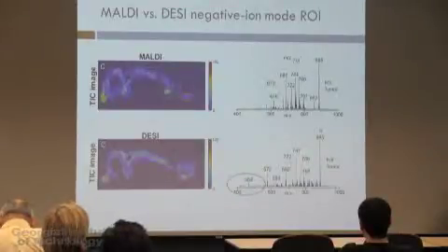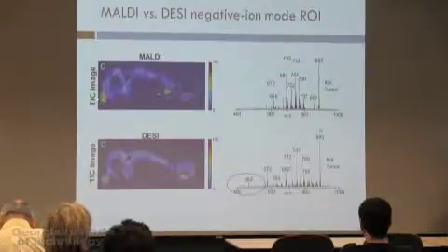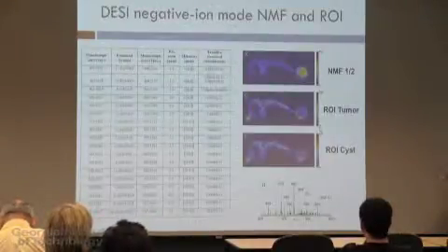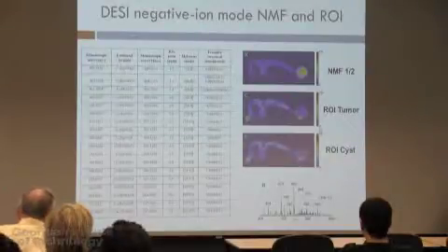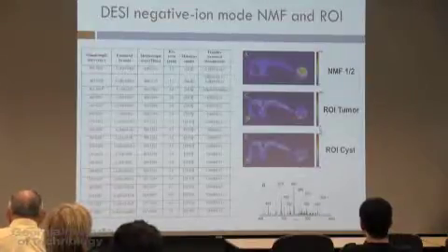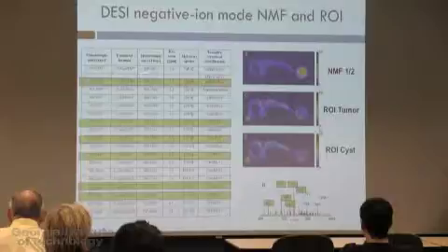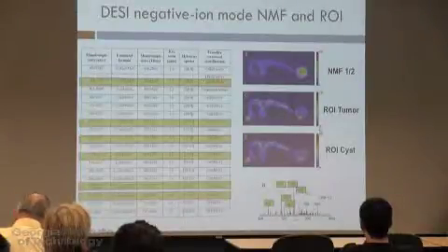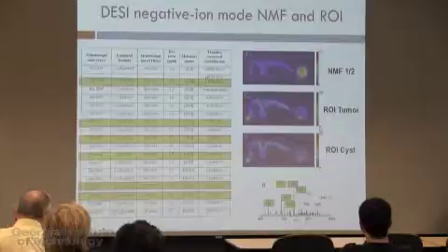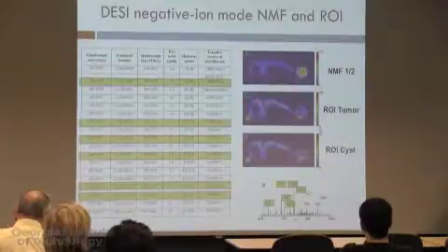On the other hand, look at the MALDI data for the ovary. The ovary and the early stage tumor are lighting up like crazy in MALDI. So there are things that we see in MALDI that we don't see in DESI and vice versa. All right, it's a long list, but what's important here is that these are the main species that we see changing in early stage tissue. They're all lipids. The ones that I'm highlighting here are actually also changed in blood. So we went back to the blood metabolomics data set and we looked for those. So there's a connection between what's happening in the tumor tissue and what's happening in blood.